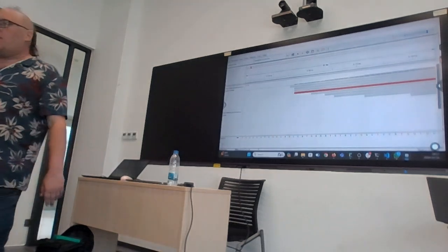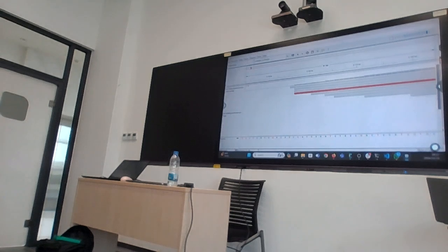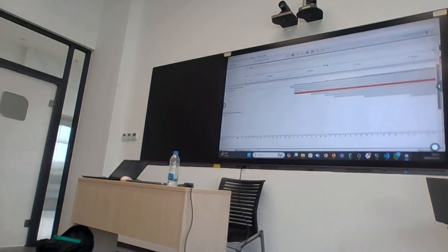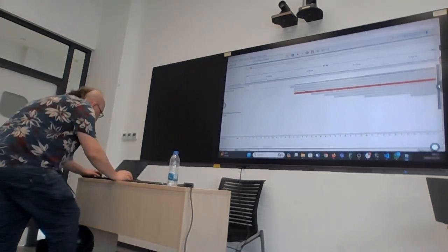Okay, and as the last task, I would like everybody to install IGV and look at this themselves. You don't need to download IGV. IGV is in the stuff that you extracted. Let me just show you. Show, not tell.